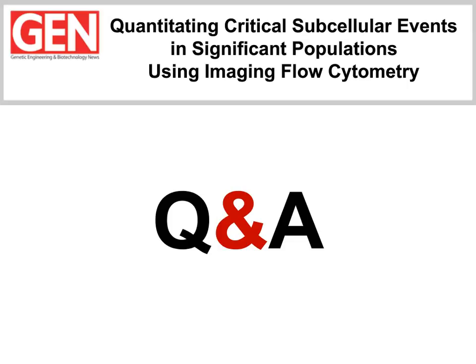One of the important things that we would recommend if you're getting into imaging flow cytometry is having a decent cell pellet. If you have a sample of cells and the pellet is very small, by the time you've gone through so many iterations of staining and then washing of the cells to wash away excess antibody, you always lose a few cells on the way through. So a good number of cells as a starting point will ensure success, so that you have a decent number of cells that go into the imaging flow cytometer when you do your sample run.